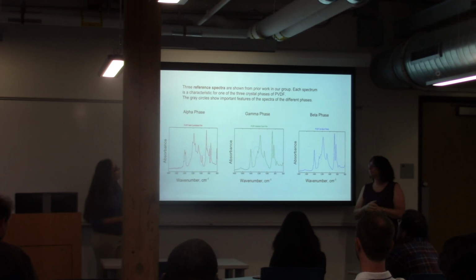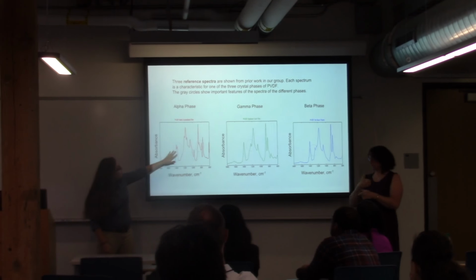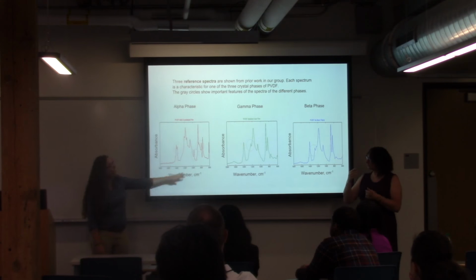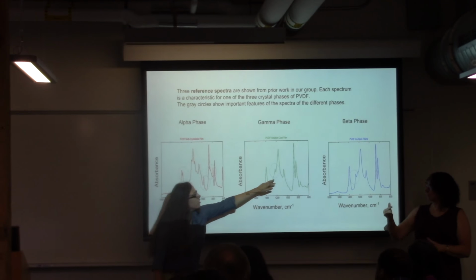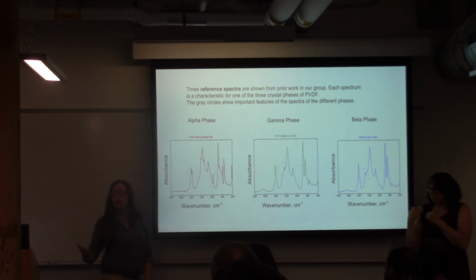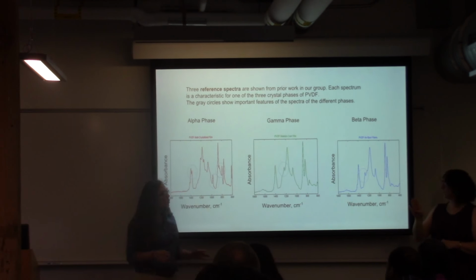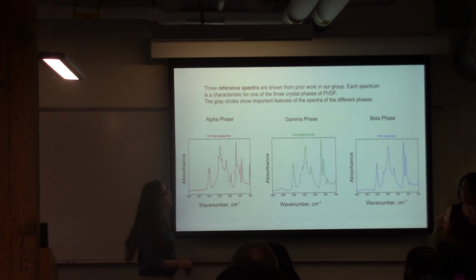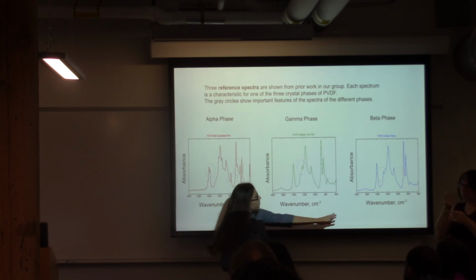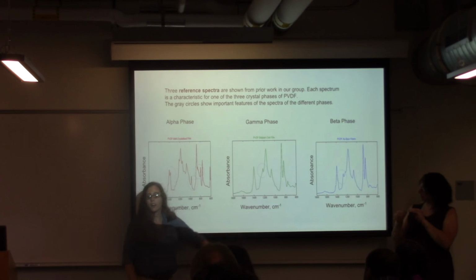So for the alpha, you see how the phase is out. This one helps us tell that this is the alpha. As for the gamma, this one little key right here helps us identify gamma. As for beta, it looks almost identical to gamma, but you can see a little difference. See the line, it looks like that. Gamma.